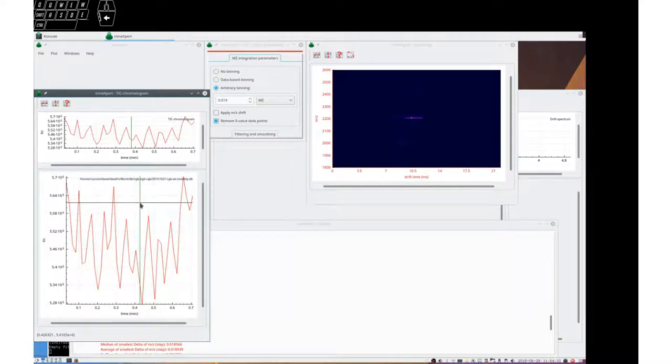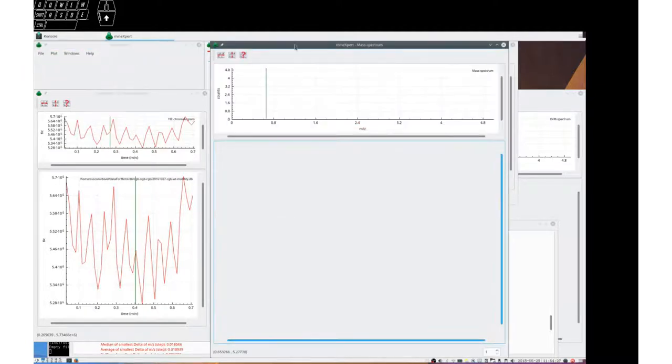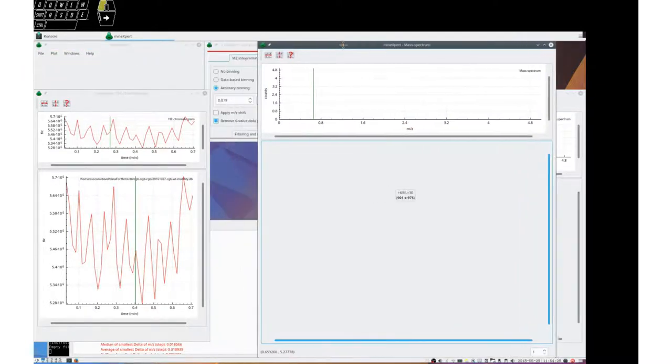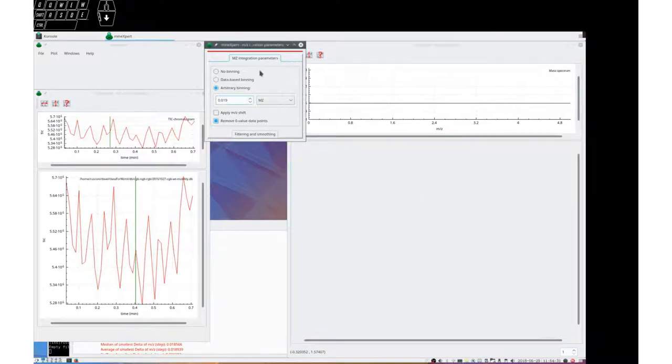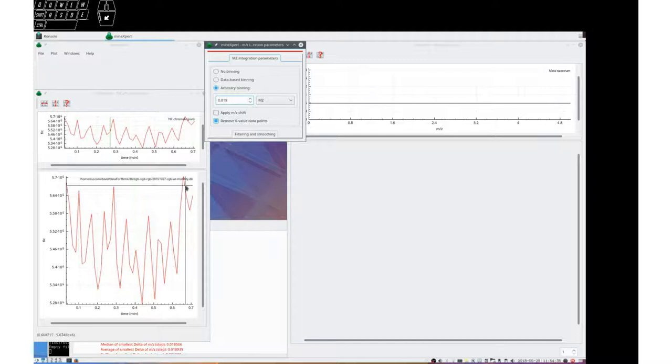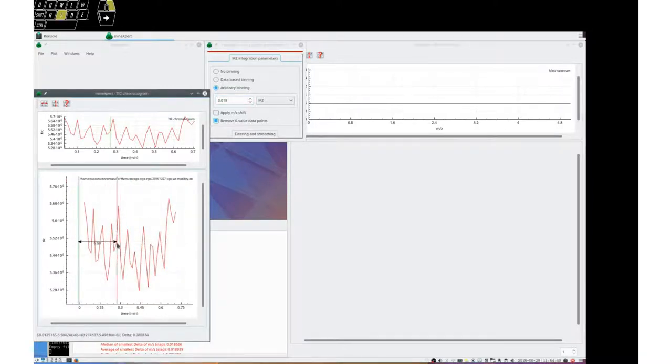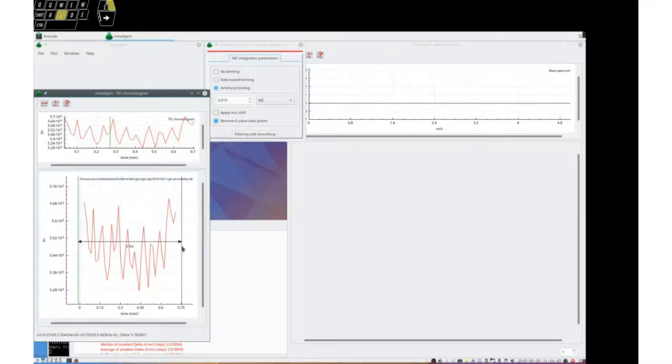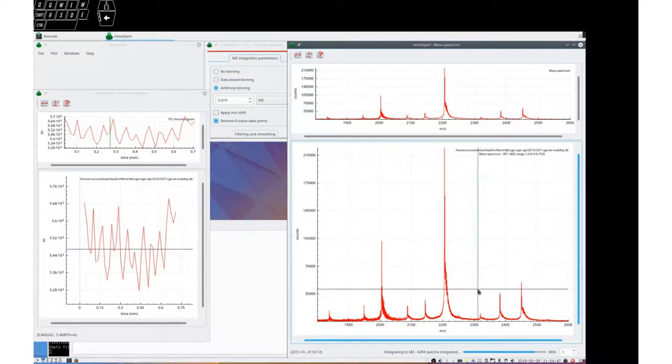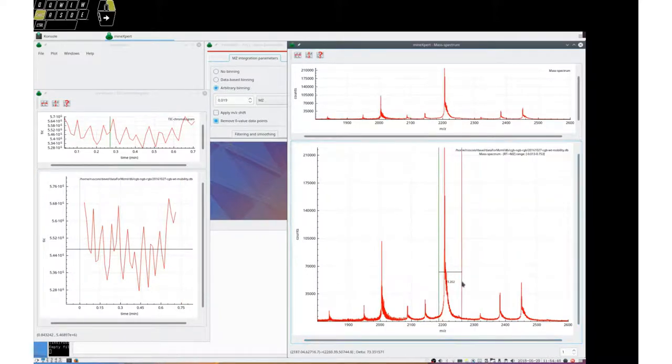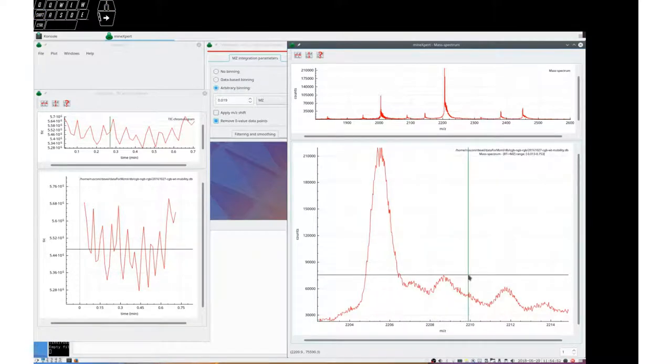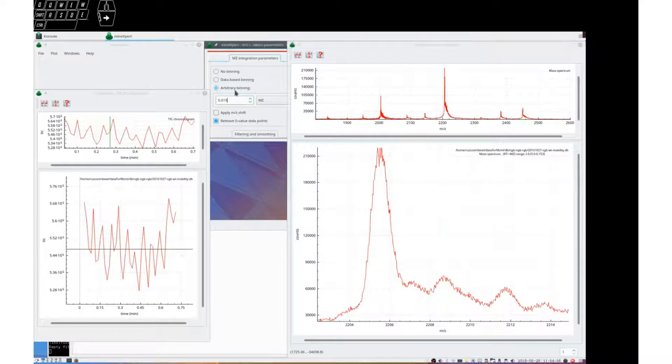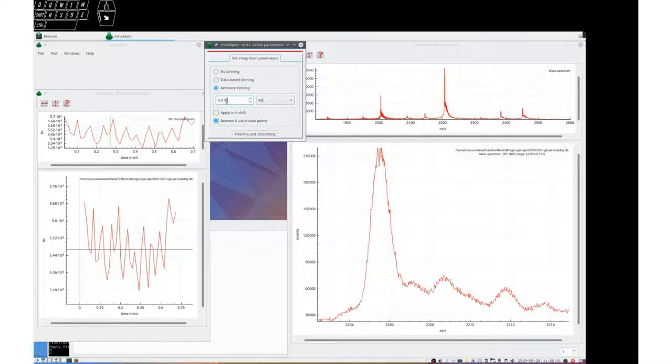If we ask to show the mass spectrum window now, we see it is there. Let's put it there, and we have the integration parameters window here. Let's integrate this tick chromatogram into a mass spectrum. This is the obtained mass spectrum. We can see it is pretty neat with a binning of 0.019 MZ.